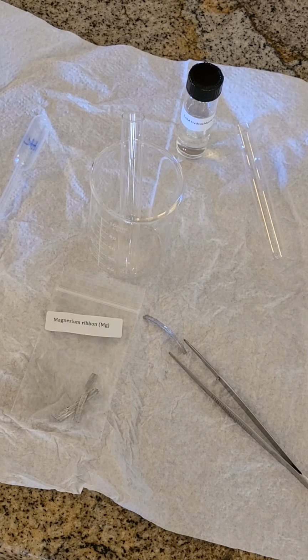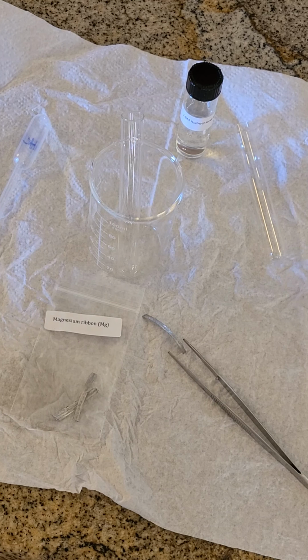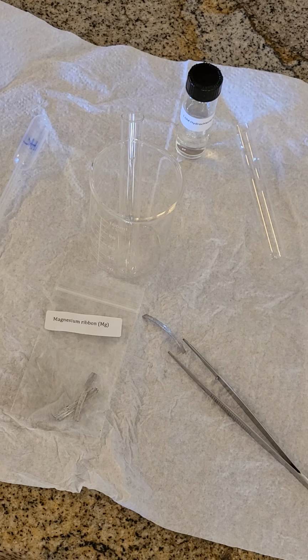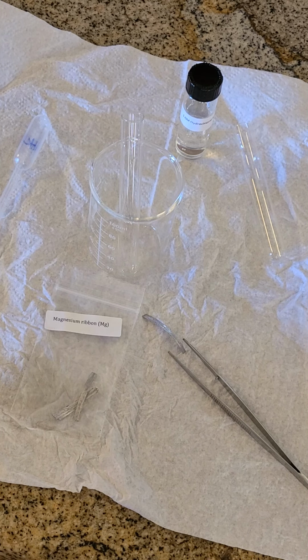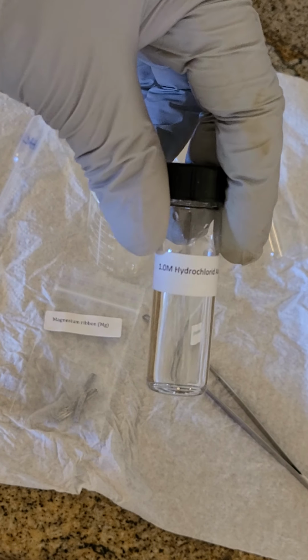Hello, Chemistry 100L students. This is our sixth reaction, reaction F, the magnesium ribbon with the muriatic acid, or just hydrochloric acid. It's a binary acid. We learned this naming system. It's HCl, so we use the chlorine as the root. That's where we get the chlor, and because it's binary, we add the hydro prefix and the ic acid suffix to get hydrochloric acid. So you were given some hydrochloric acid.